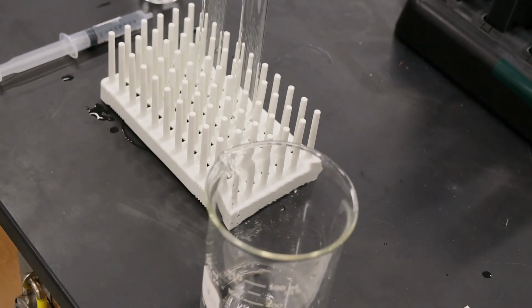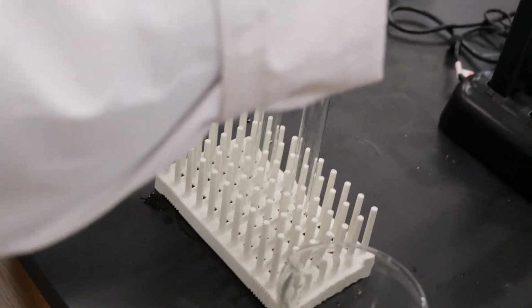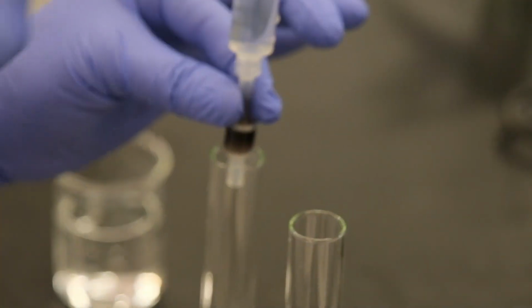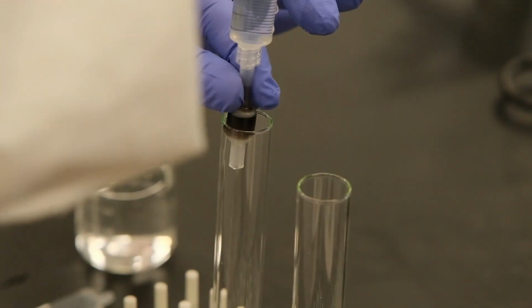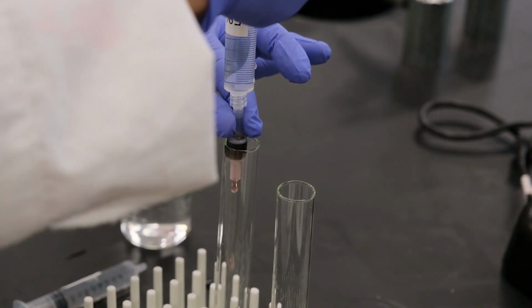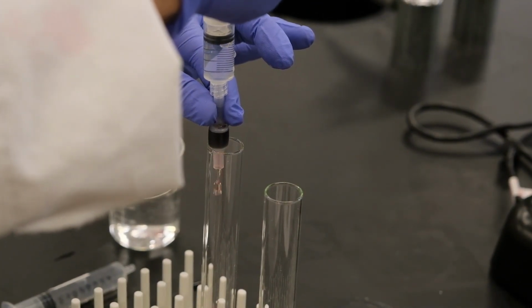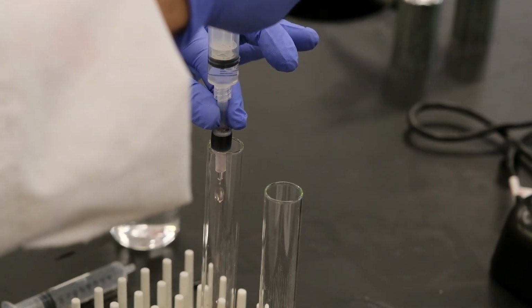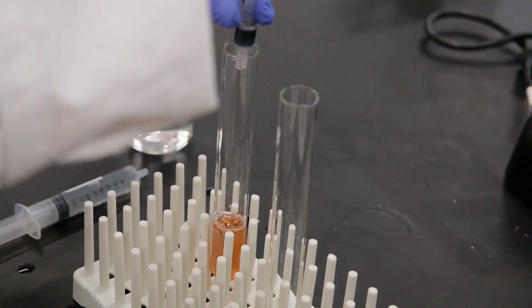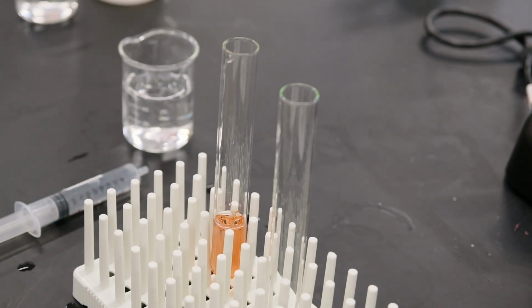We push through on tube 1 the 5% isopropyl alcohol, which should isolate only one of the two dyes, the red one, as you can see here. To make sure that we collected all the red, we push one more 5 milliliters.